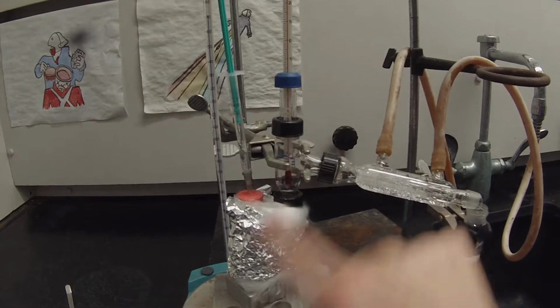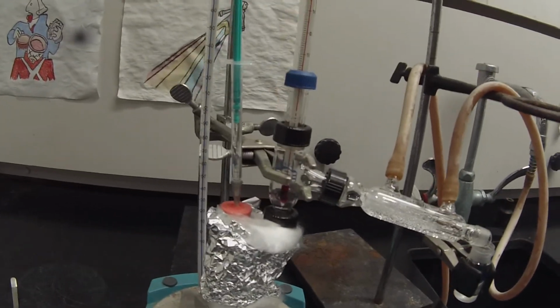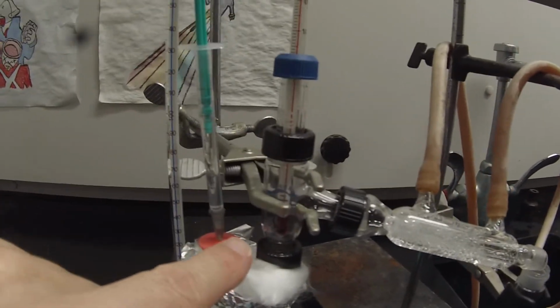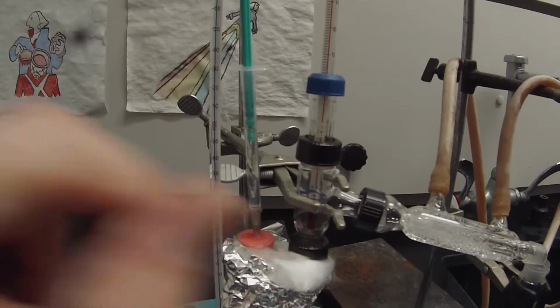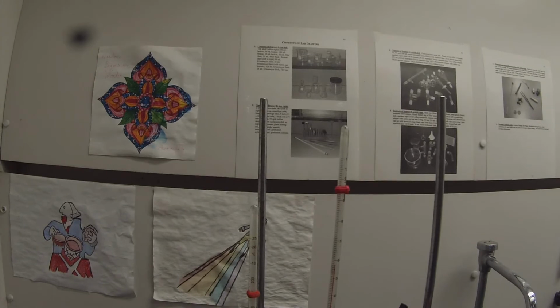Definitely a nice drop there. You can see it just dropped off, maybe, if the camera's pointing at the right angle. I don't know if you can make out with the camera that the sides here are definitely condensing liquid, and there was another drop. So we're rising pretty steadily.